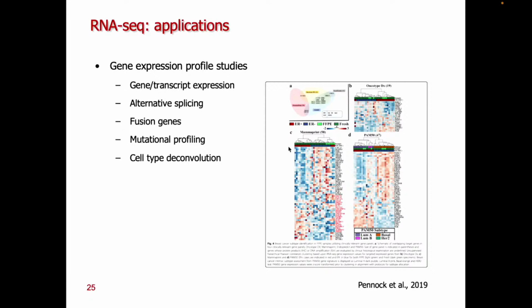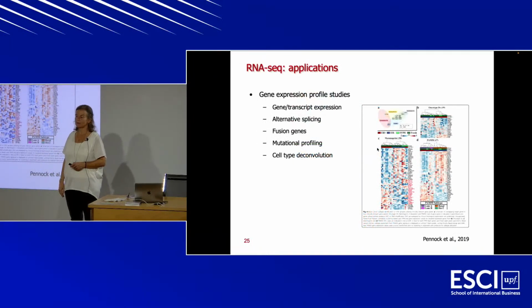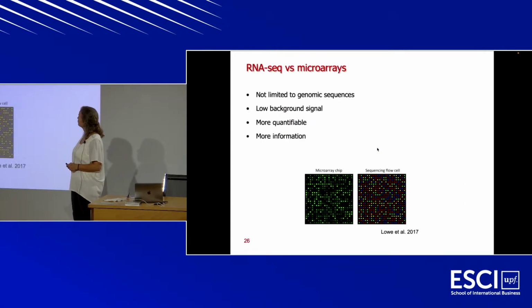And here is an example of the Oncotype DX, MammaPrint, and PAM50 performed on RNA-seq data. So those classifiers that were done using microarrays can also be done in RNA-seq. And this is very convenient also in clinical practice.